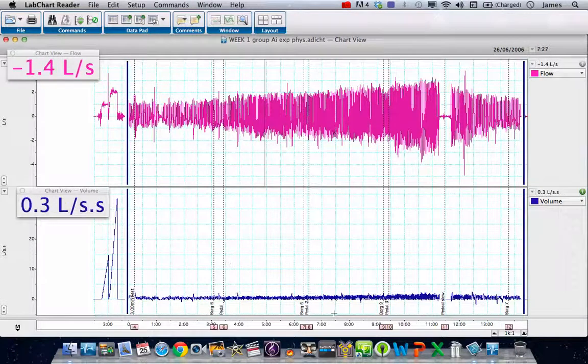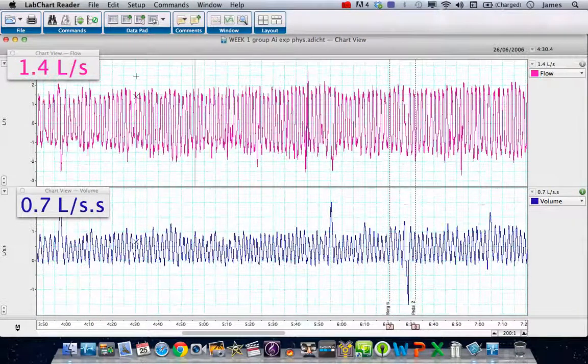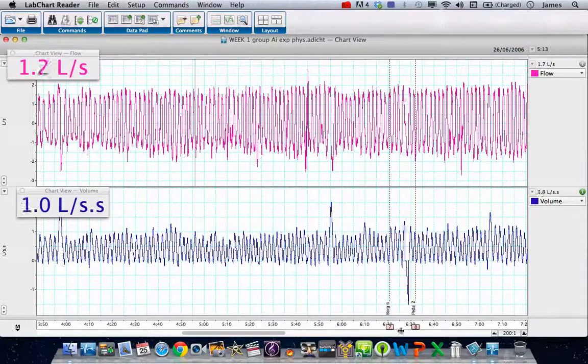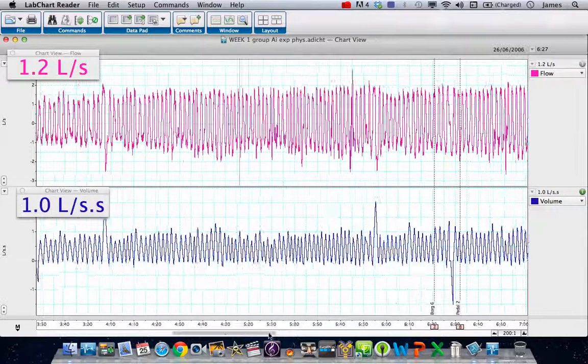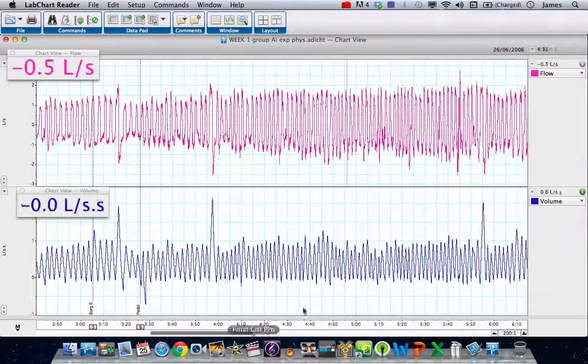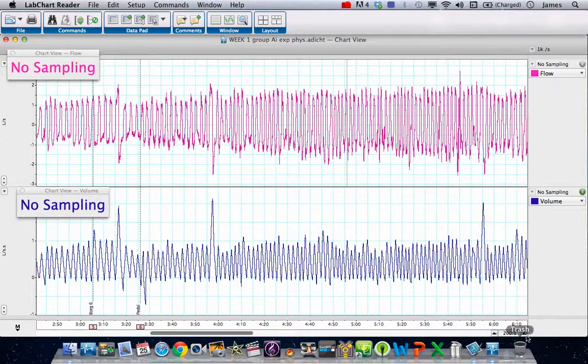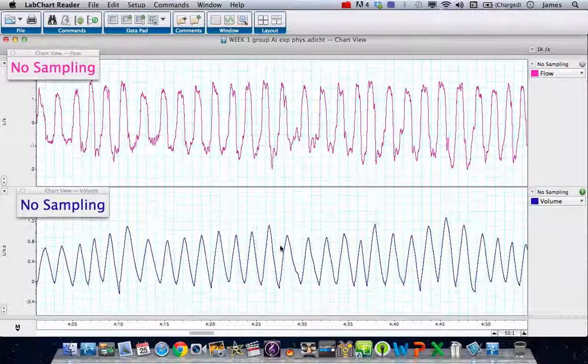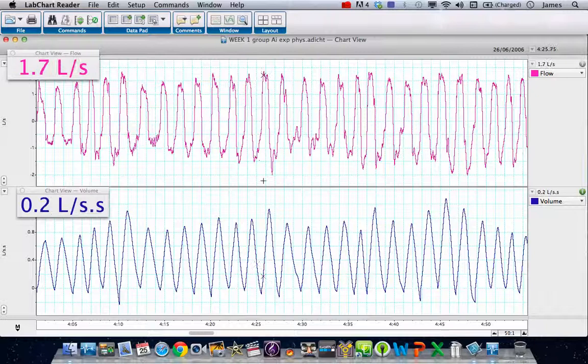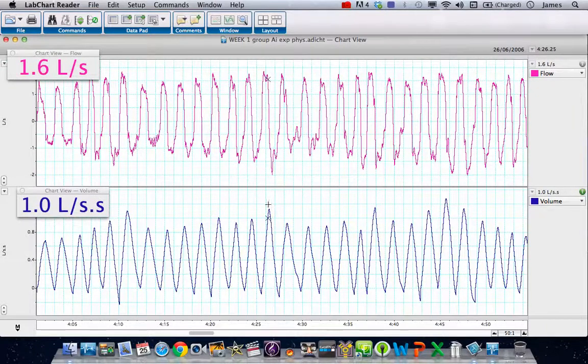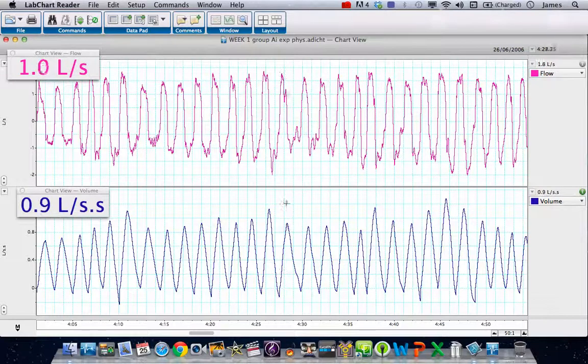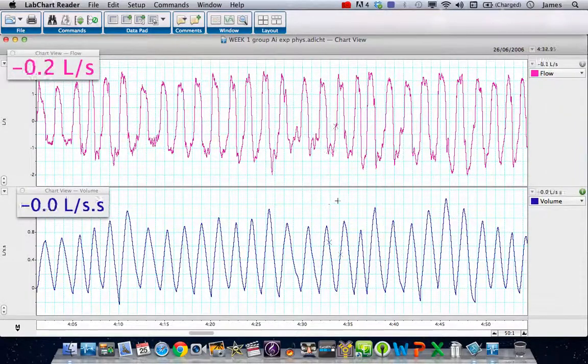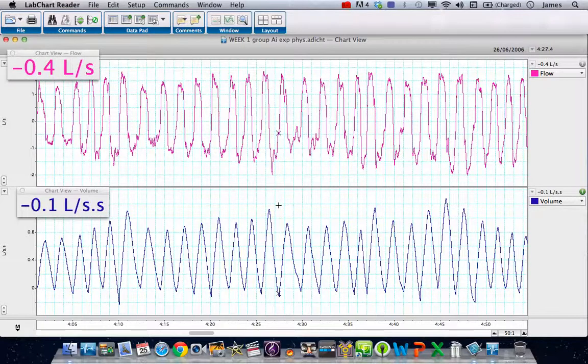Let's zoom in a little bit on the data and the software will expand it for us. You can see now that we've got on the bottom here the integral showing volume. If I zoom in during each respiratory cycle, you can see that there was a volume of gas moved—one liter, 0.9 liters, 0.9 liters, 0.7 liters, et cetera.